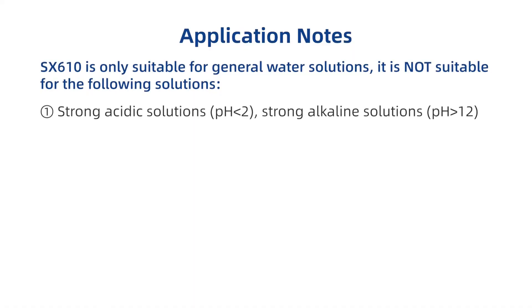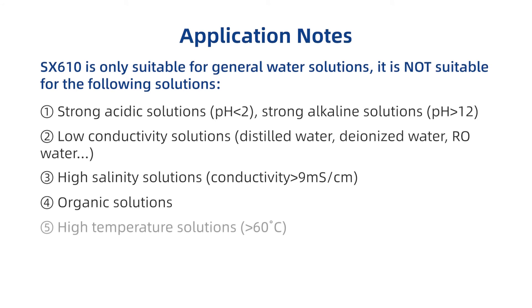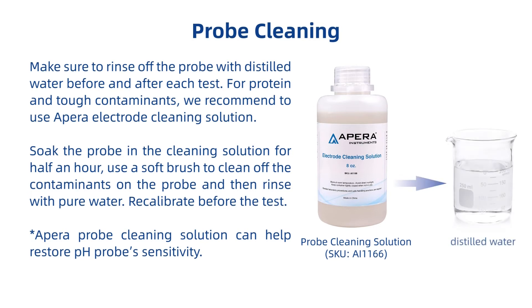Application notes: Make sure to rinse off the probe with distilled water before and after each test. For protein and tough contaminants, we recommend using a para-electrode cleaning solution. Soak the probe in the cleaning solution for half an hour, use a soft brush to clean off the contaminants on the probe, then rinse with pure water. Re-calibrate before the test. The para-probe cleaning solution can help restore pH probe sensitivity.